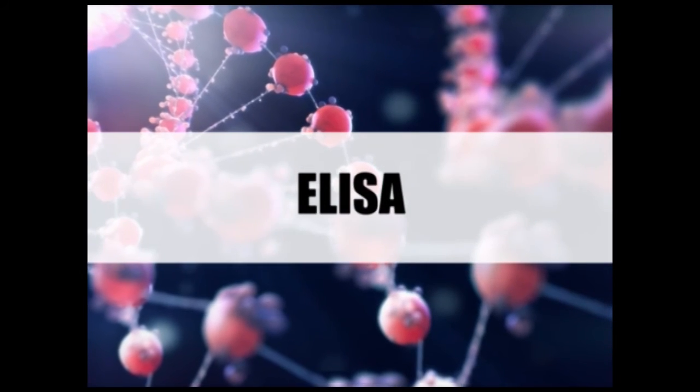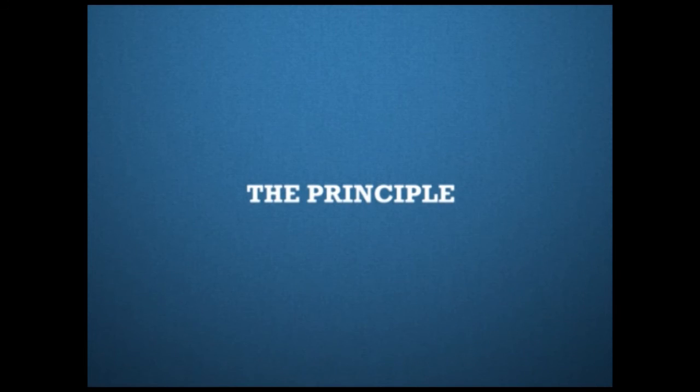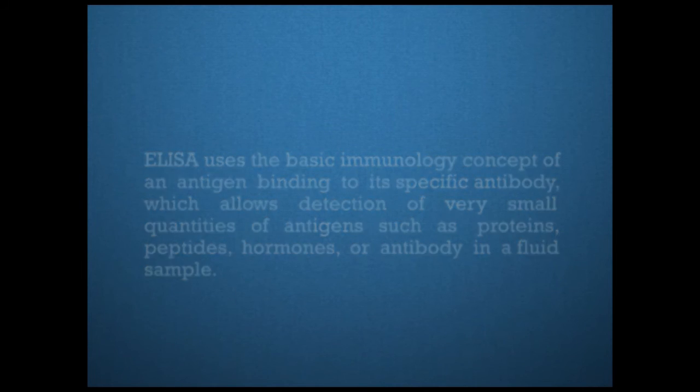Now let us discuss ELISA. In principle, ELISA uses the basic immunology concept of an antigen binding to its specific antibody, which allows detection of very small quantities of antigens such as proteins, peptides, hormones, or antibody in a fluid sample.